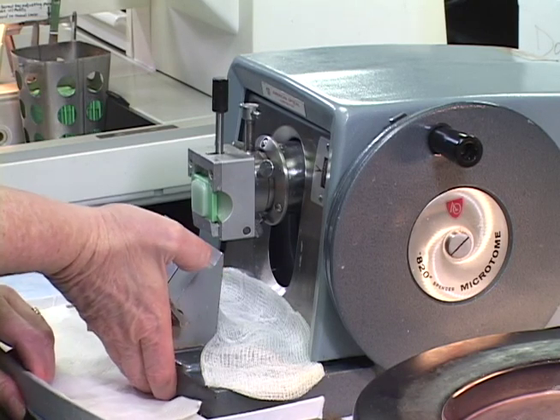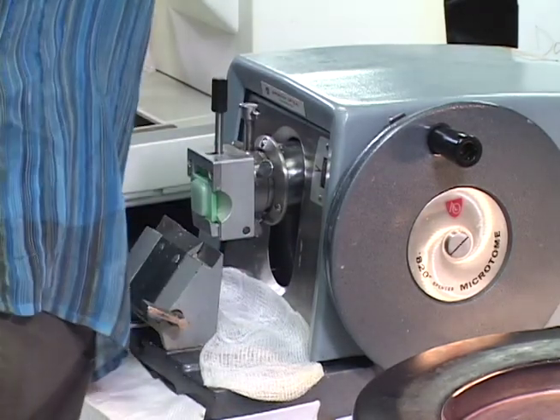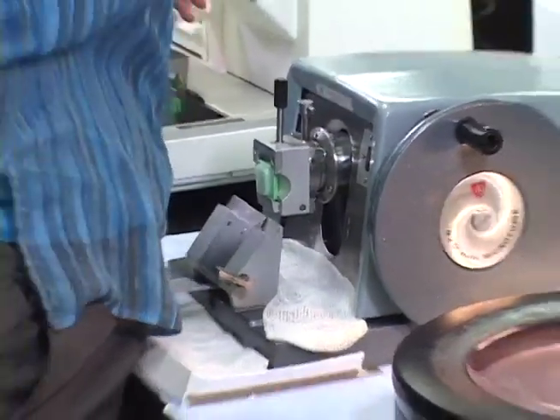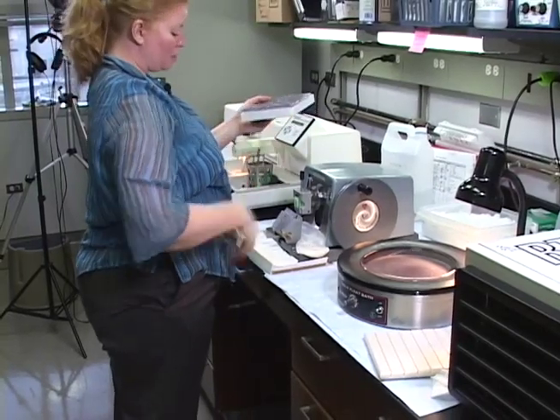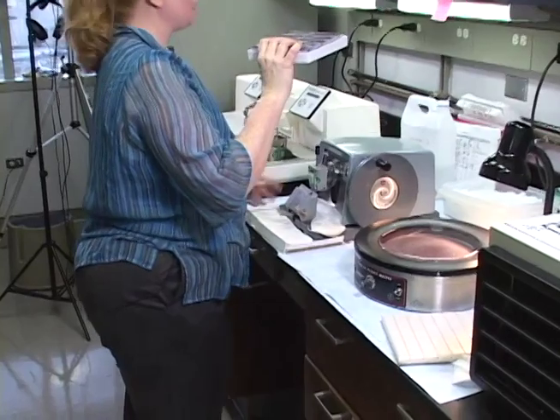And, you know, I made this little paraffin gallery thing out of our cover slip boxes. The leftover cover slip boxes that we had, I just cut a couple of them, the top and the bottom, and made this nice paraffin catch.